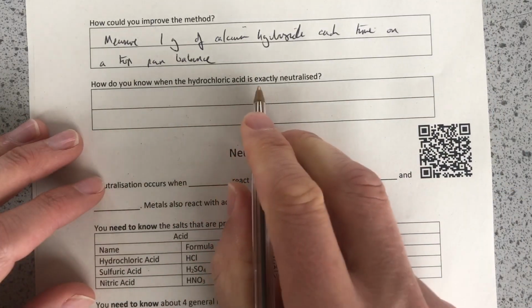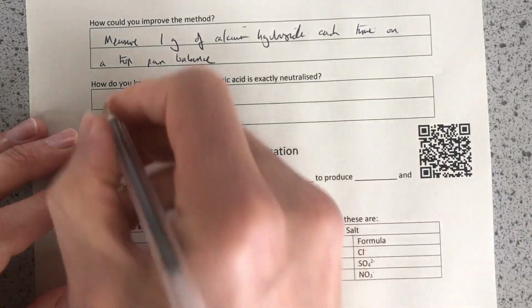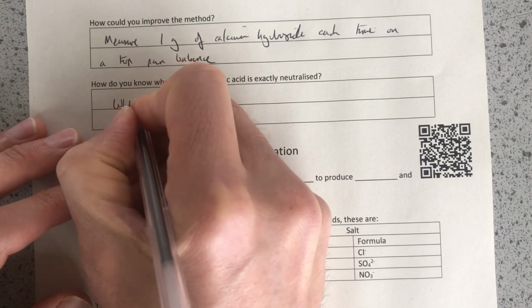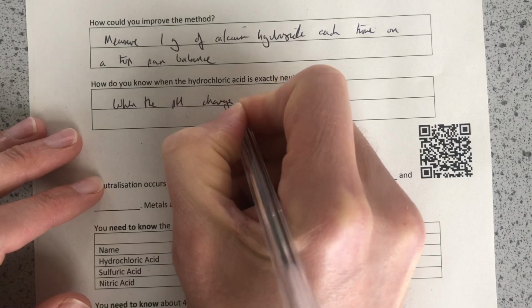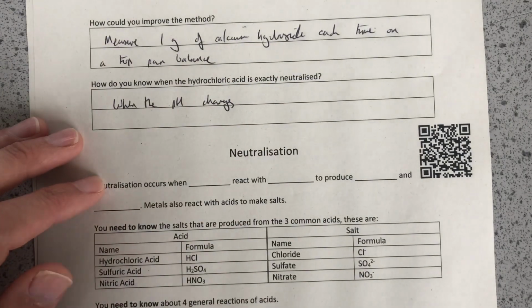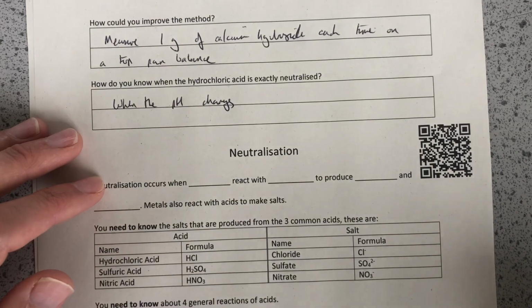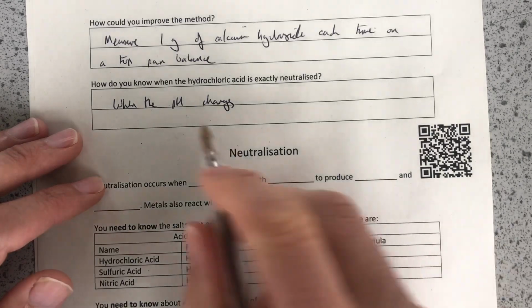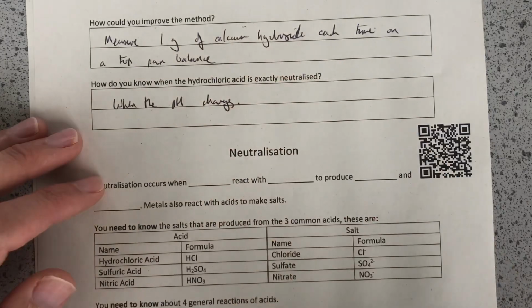How do you know when the hydrochloric acid is exactly neutralised? It's when the pH rises, when the pH changes. Now, to know when it exactly neutralises, we would need to add the calcium hydroxide extremely slowly, stirring all the time. And we didn't do that. But we could do it again and slow it down and try and work out when the exact neutralisation point is. And that would be when the pH changes. And that is our second core practical.